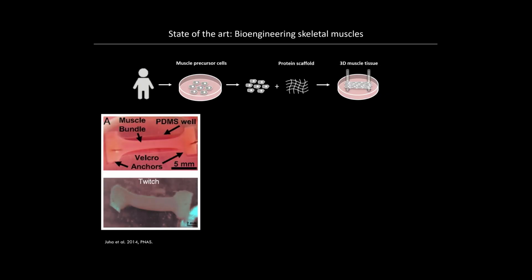This is actually a muscle here. Let me run the video. This will twitch in a second. Yes, boom, here it is. So this is kind of cool because with this, you can really very nicely start asking questions about forces in muscle organization. It's not a real muscle, right? Because it misses all the developmental features, but it's a very nice model system. It's much better than just looking at them in a 2D situation here.